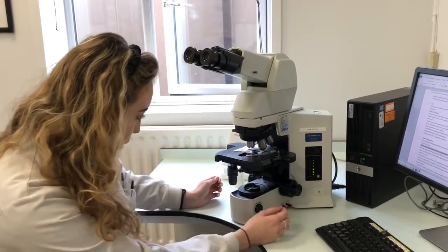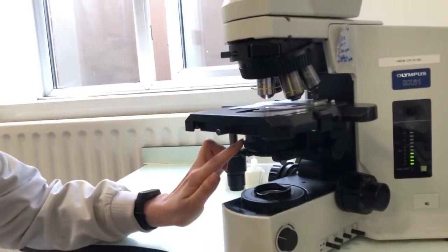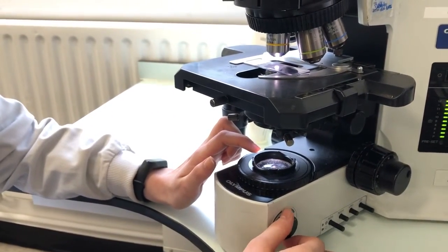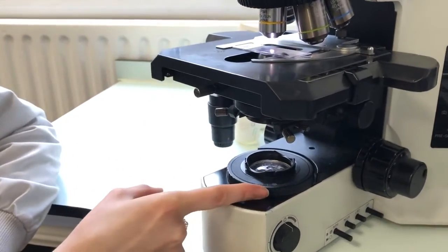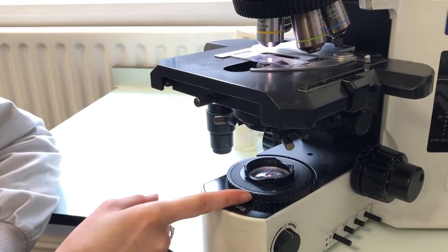So at the bottom here we have the diaphragm. Here we have a light source. We can adjust the light source from very bright to very low. And we can open and close the diaphragm to adjust the light source as well.